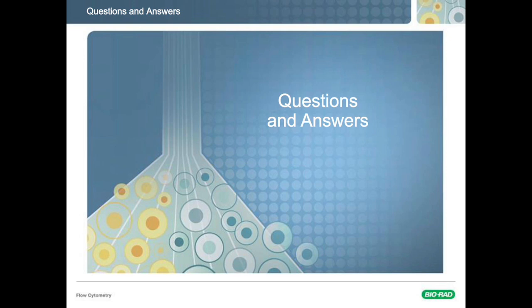So I always think of this as you're looking at this droplet and it's pulling down, pinching off, and as soon as it pinches off and breaks away, at that point, whatever charge it has, because of the voltage given to it, it's going to break away with. And so if you do this in a very bad way and you set your charging to be changing, it's basically a square wave.